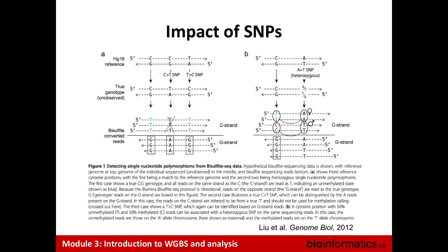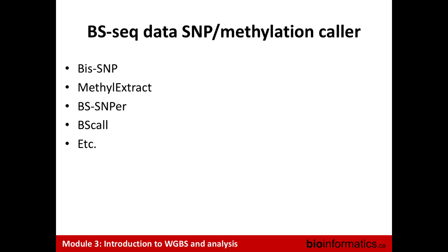Okay, so one point that Martin made that's important and I forgot to mention, is the annotation of dbSNP for these calls is quite important. Most of the variants still are known, the location of where they are. So annotating the methylation calls using even common genotypes is an important step.